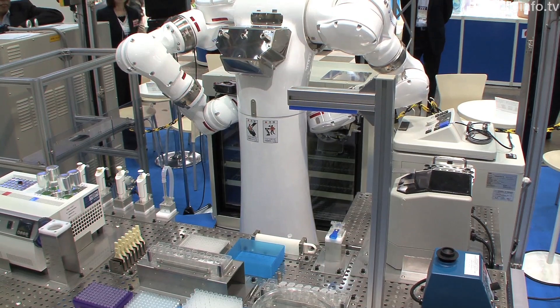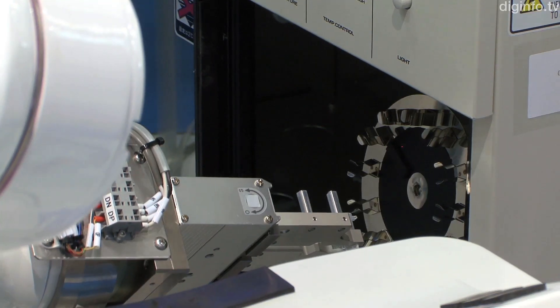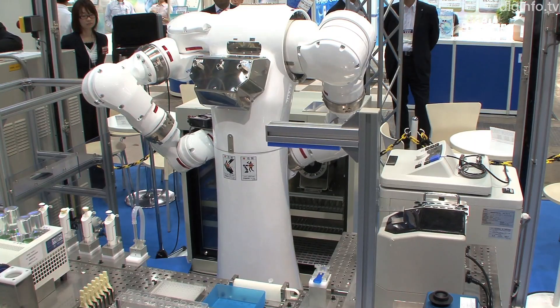Mahoro is sold by Nikio Technos, and it's already being used at pharmaceutical companies and universities. From now on, the company wants to further enhance the safety of the robot so it can work in coordination with people.